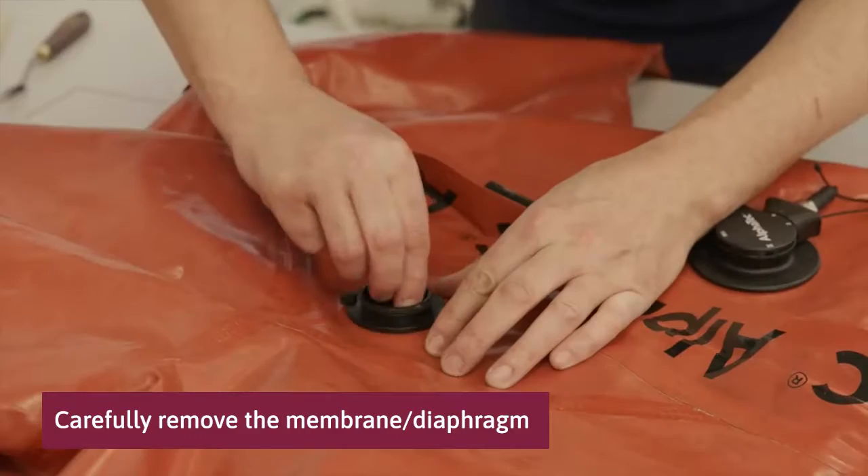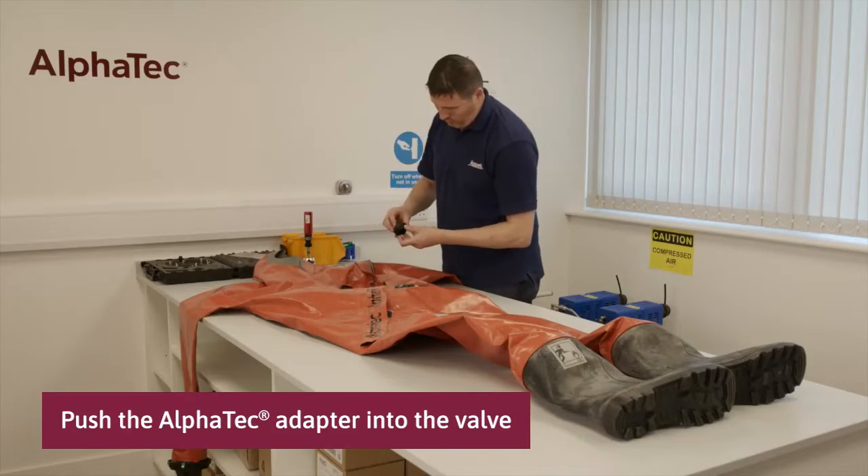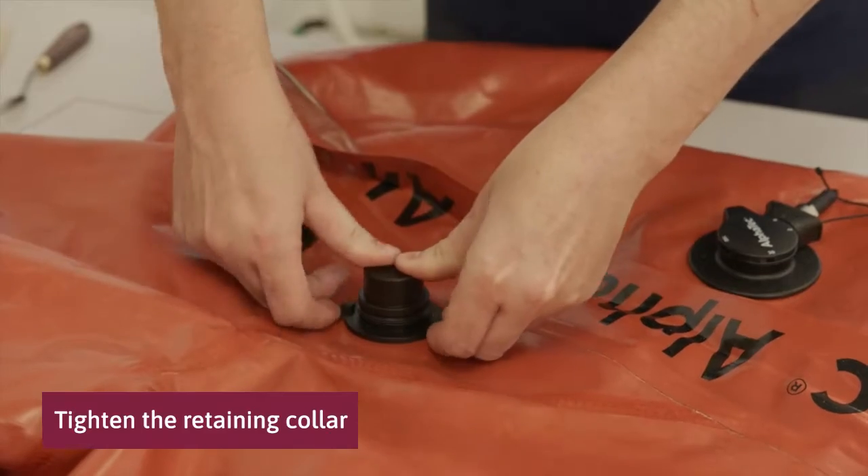Carefully remove the diaphragm. Push the black Alphatec adapter into the valve and tighten the retaining collar.